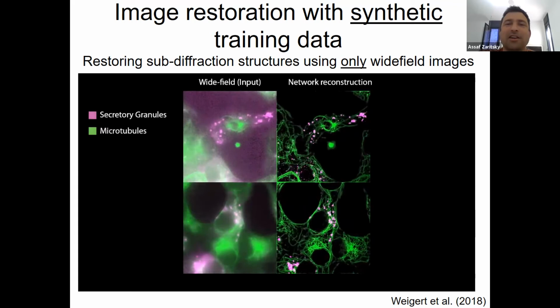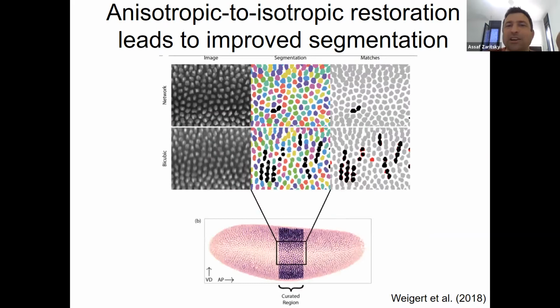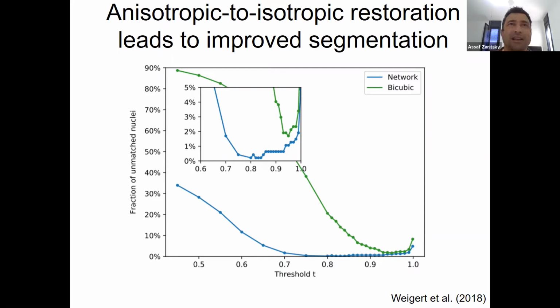I thought that you are going in a different direction, but in principle, this type of analysis, right? I mean, here you see the post-processing. After you have beautiful images, you want to segment and track cells. So you can measure the number of mistakes in segmenting cells correctly, and the accumulated mistakes in tracking. And this would be the measurement. Is this what you asked?